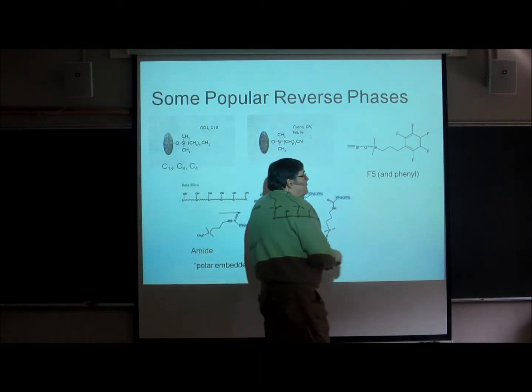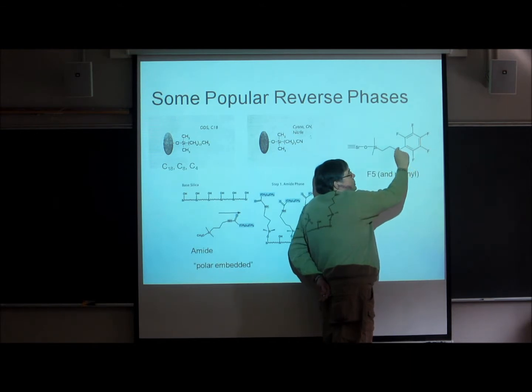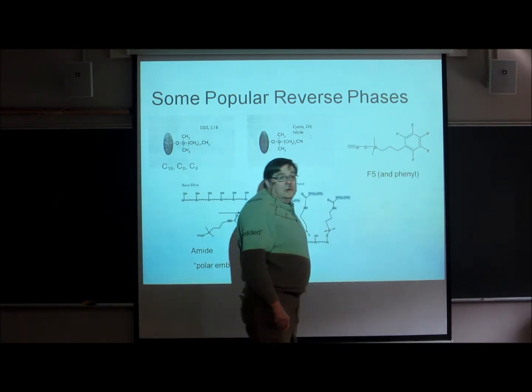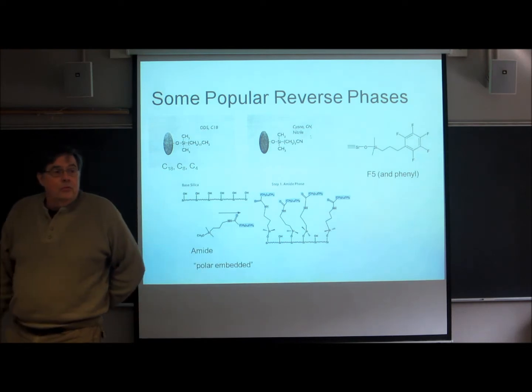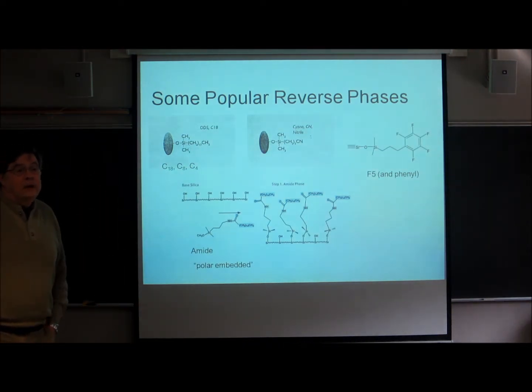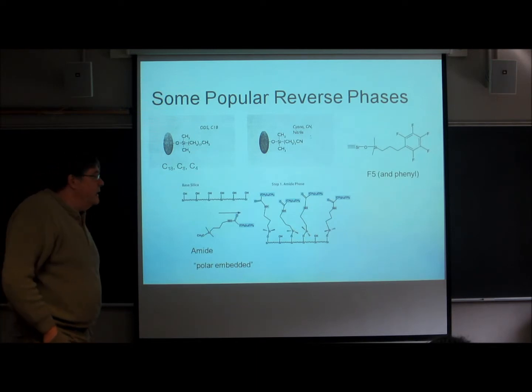This compound in particular, there's enough electronegativity on these fluorines that they pull electrons in this way and create more positive centers here, which can be attacked by solvent, so that you find that these columns will degrade more quickly than the C18 columns. But again, they have a selectivity that you would go looking for if you had a particular problem with solvent. Okay, all right, the F5.